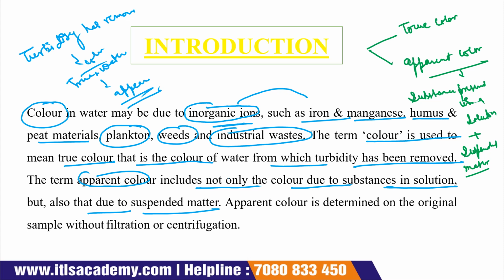Now, apparent color is also determined on the original sample without filtration or centrifugation.